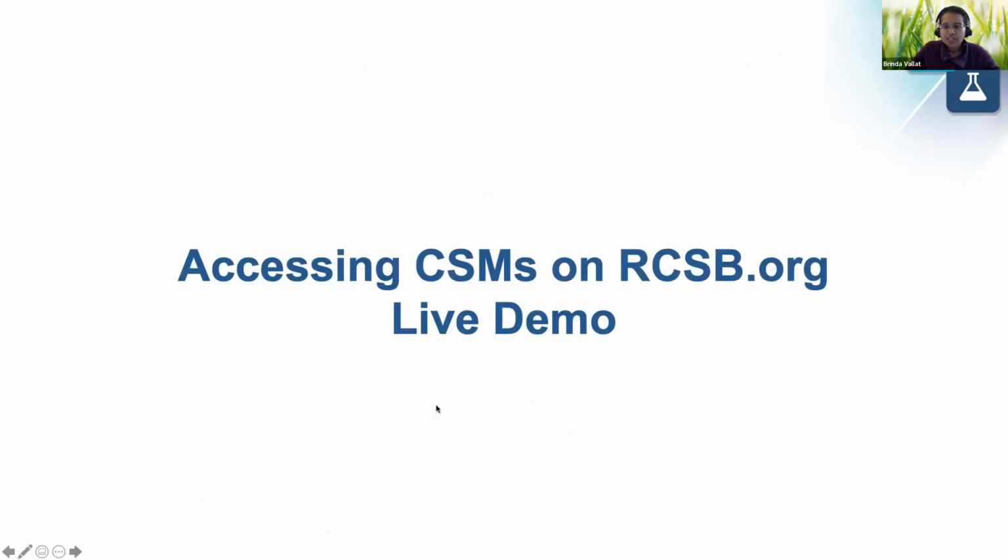I will now move on to the tutorial, the live demo part of this session, and showcase a few case studies that have been introduced by Dennis, Janaka, and Chris earlier today, including the Arabidopsis thaliana resistosome, the riboflavin biosynthesis pathway, and the aldehyde dehydrogenase from Micrococcus luteus. My goal here is to use these case studies to demonstrate the tools and functionalities that we have on rcsb.org to study these computer structure models.